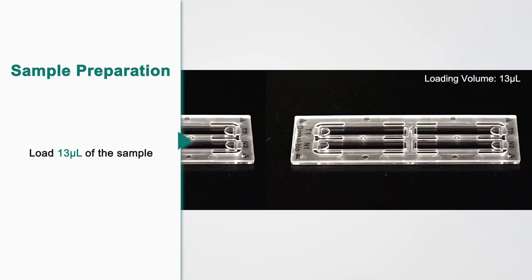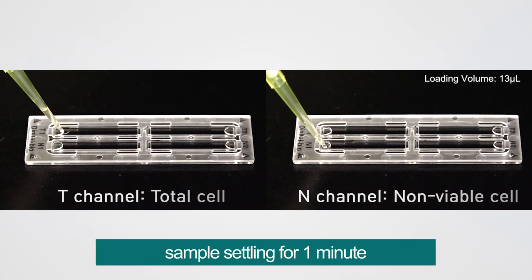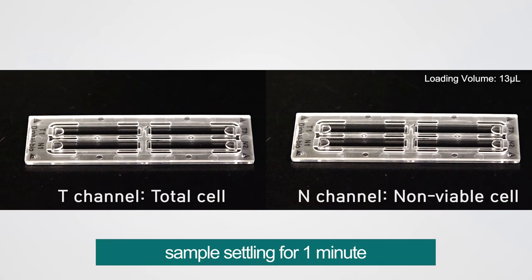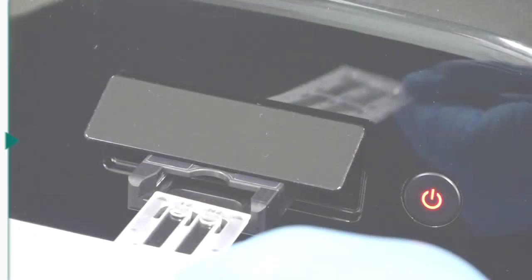Load 13μL of mixed sample onto the slide. T channel is for total cell and N channel is for non-viable cell. After loading the sample, wait one minute for sample settling.